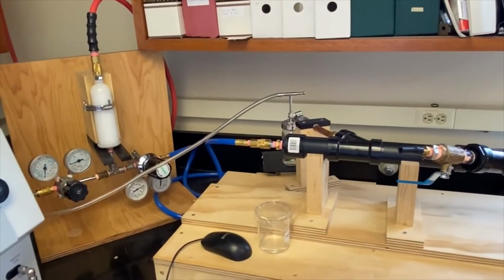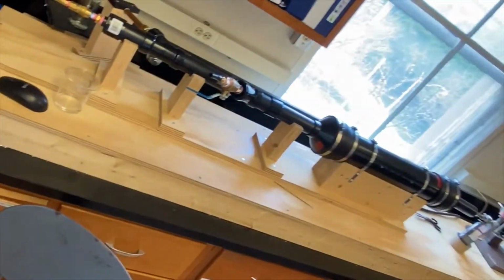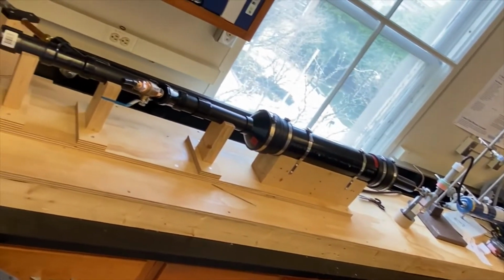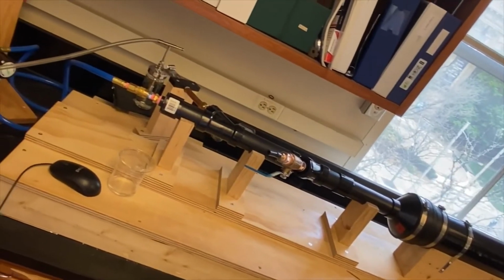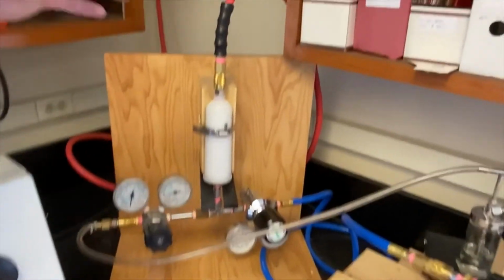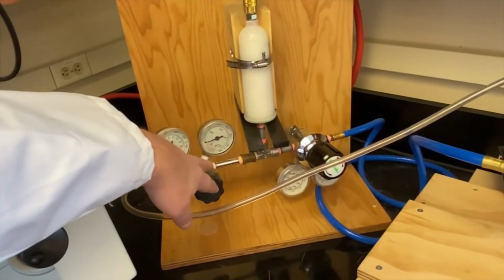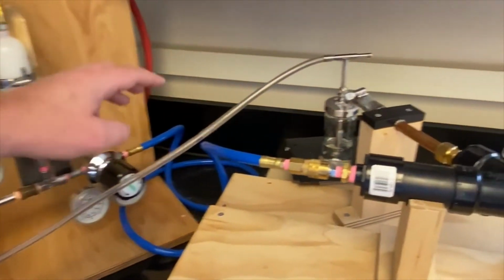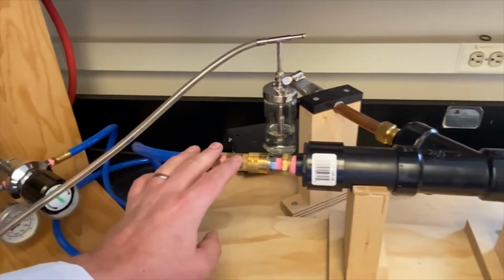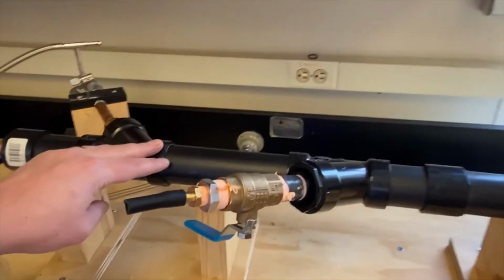So when we first started out doing mask testing, we used a homemade mask testing apparatus that looks something like this long tube. And this is the thing that's depicted more accurately in the diagram that I just showed. So here you can see air coming in through this red line from a compressor, and it's passed through a HEPA filter and divided into two air streams. One airstream is passed to a nebulizer that contains a salt solution, and the other airstream is brought into what will eventually lead to the mixing chamber.